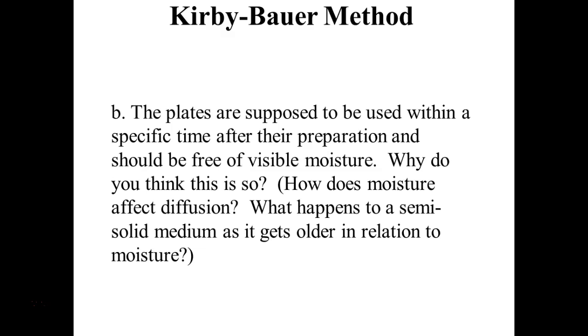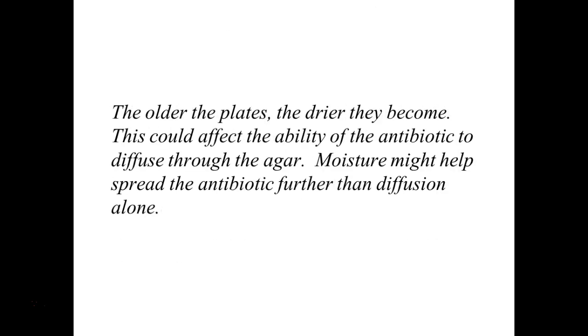Where a dry paper towel, it'll pretty much stay where you put it. So it would increase the diffusion, though. It would screw up your diffusion rate. And again, it would make your results inaccurate. And if they're old, then they're going to be dry and your diffusion's not going to be enough, right? And your zones are going to be too small. So you need it just right. You need Goldilocks, right? Because moisture does affect diffusion.